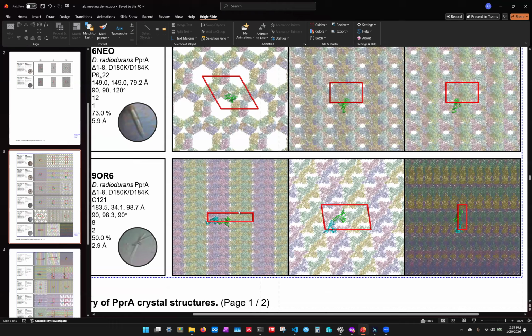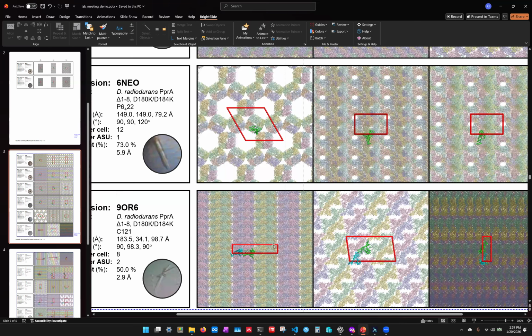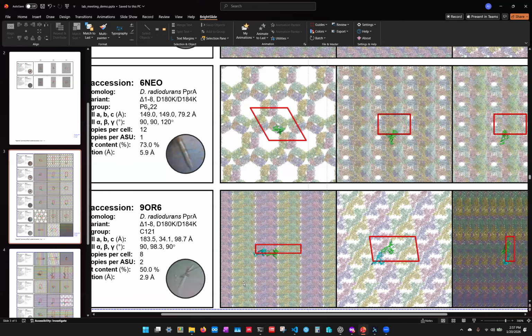I feel like those are very large gaps. That looks odd to me. It is. And that brings us to an interesting thing. If you look at all the gaps and compare the volume of those gaps to the volume of the protein, and you do that for every single crystal in the entire PDB, the vast majority of protein crystals will have a solvent content of about 50%, meaning 50% atoms, 50% empty space, which is not really empty space, it's disordered solvent, but that's what those gaps are.